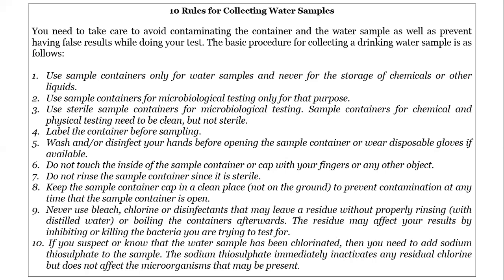And we said the fifth point, wash or disinfect your hands before opening the sample container, which you all know, because if you want to do something sterile, you must have clean hands. The sixth point, do not touch the inside of the sample container or cap with your fingers. It's very easy, you understand. Seventh point, do not rinse the sample container since it is sterile. This is actually for microbiological testing containers.